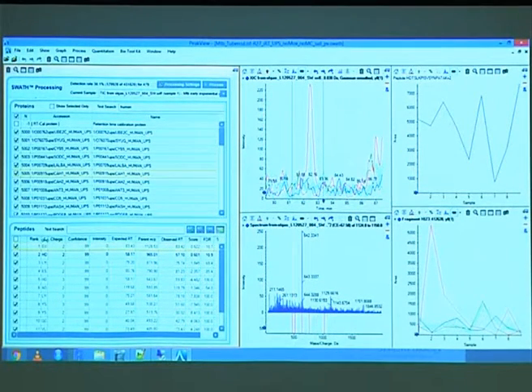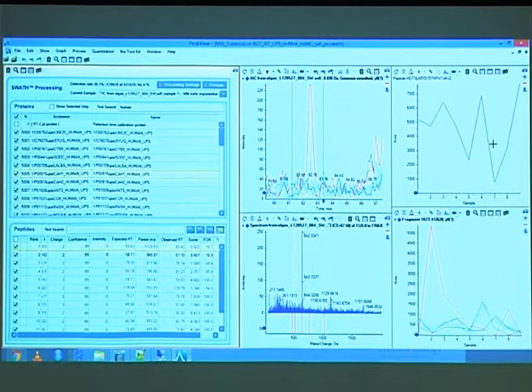I actually don't know. Since they were not spiked in that case for this protein, there was only one that actually managed to get below 1% FDR, this one here. So only this one is represented in the peptide pane, so that's not that informative anymore.